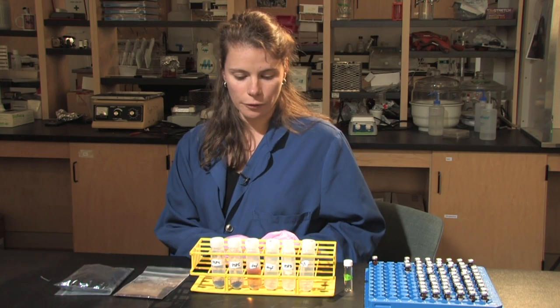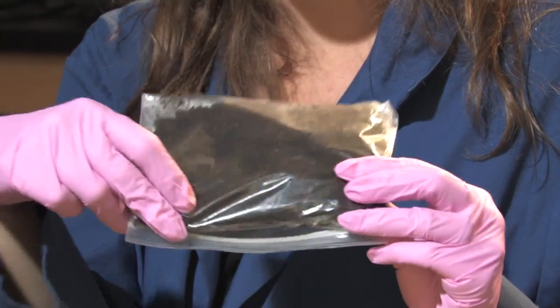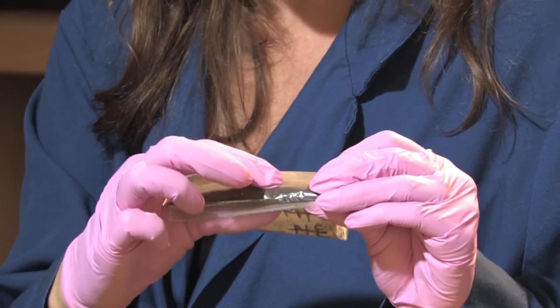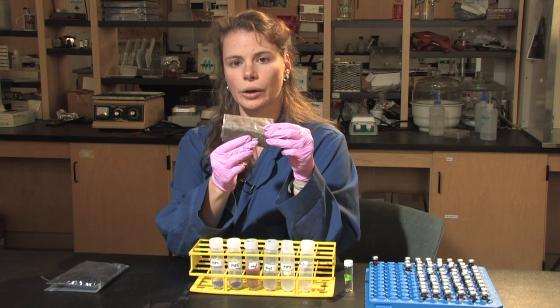The phospholipid fatty acid procedure, or PLFAs, is quite a long, laborious procedure. It takes multiple days — about four days in the lab, plus preparation beforehand. The soil comes back from the field and can be quite wet depending on the moisture content at the site. This moisture needs to be removed before we can start the procedure, so we put a subsample of the soil into the freeze dryer for a few days depending on the wetness. This removes all of the moisture, leaving us with just the soil particles.